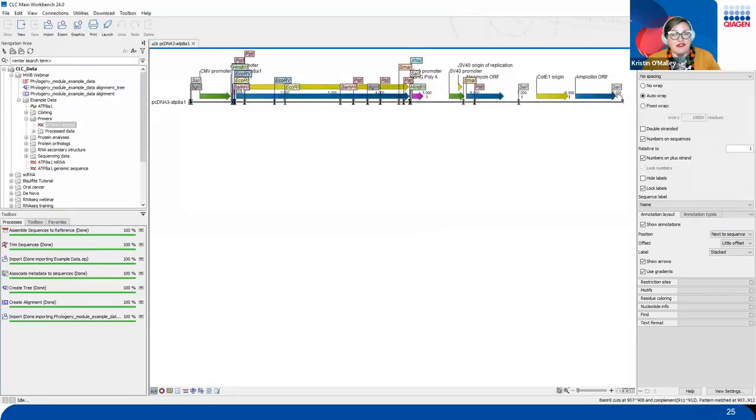If you wanted to shut these flags off, if they're overlaying on top of important information, you absolutely can, using our sequence settings to shut off some of these restriction enzyme flags to visualize exactly what all these sequences are behind the scenes. But trust me, there are the actual insert sequences that are in this yellow and the blue, as well as all of the important bits that come with this insert itself.